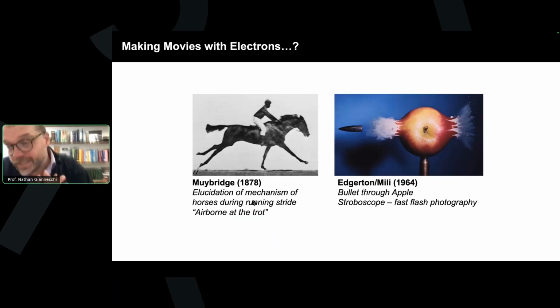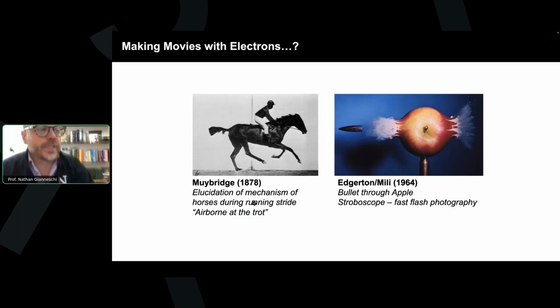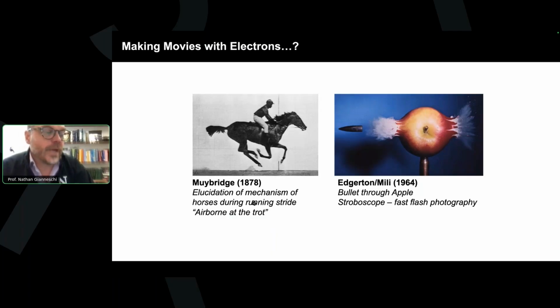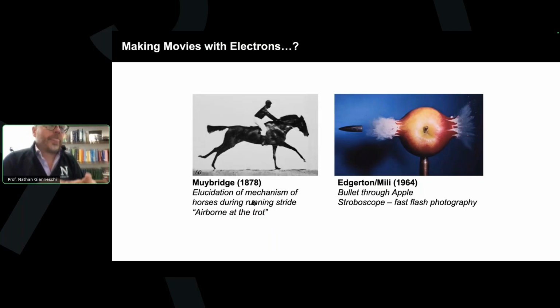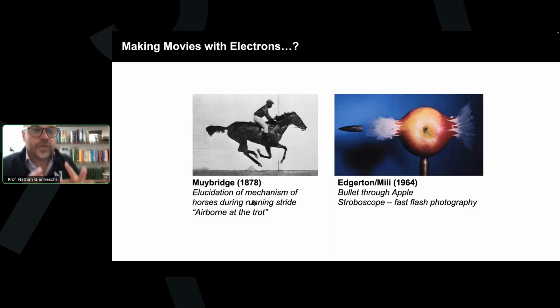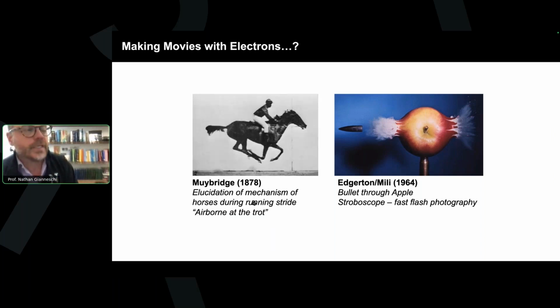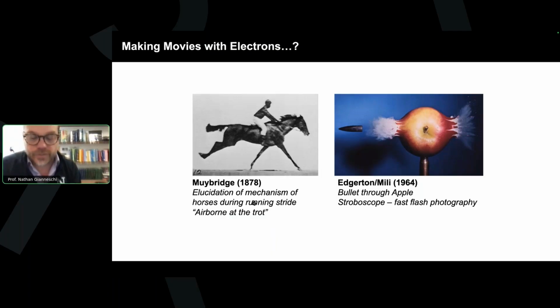And we did make some movies, but really the static stroboscopic imaging told a bit more of a story about the mechanism. But I think this was mostly about that idea that a solvated material should be imaged, let's say, in its solvated state. That is at least the concept we hope to get at with these hydrogel structures.